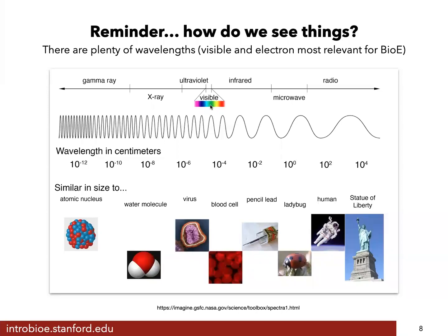If we use a light microscope, what we mean by that is a visible light microscope, we'll be able to resolve objects at a couple hundred nanometers in resolution. And here you see red is a little bit longer than green. That's why green, in the cleverly set up example, was able to see the tiny distances between the lines. But we were talking earlier about an electron microscope.